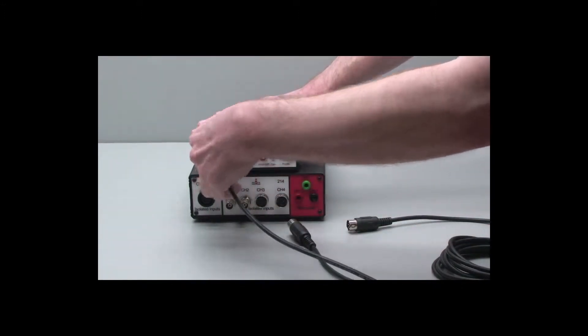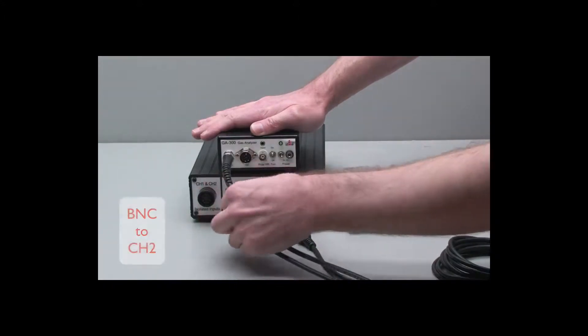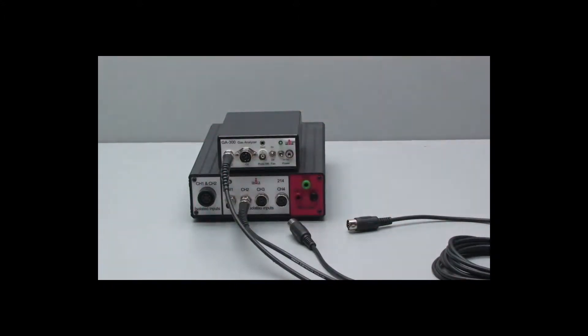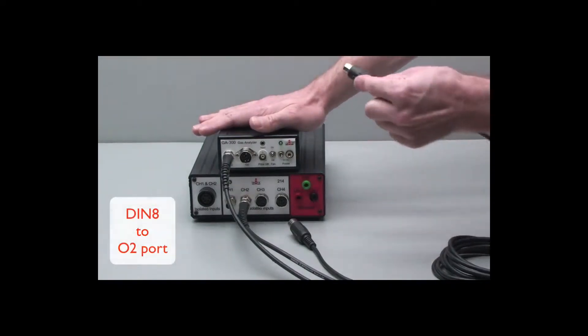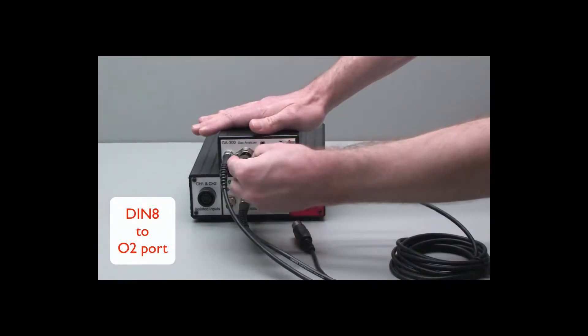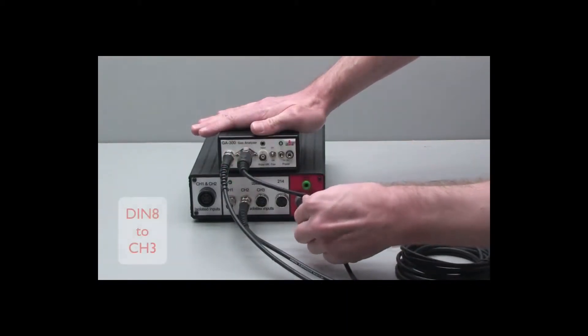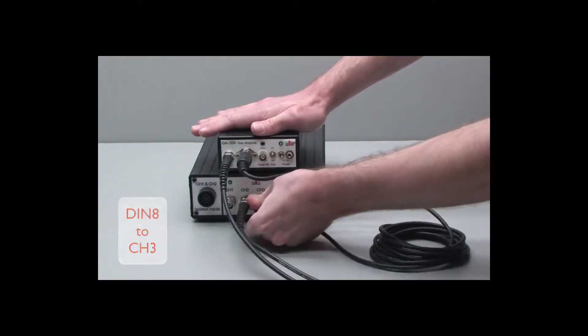and the other end goes to channel 2 of the iWorks 214. Take the DIN8 to DIN8 cable, one end goes to the O2 port, and the other end goes to channel 3 of the iWorks 214.